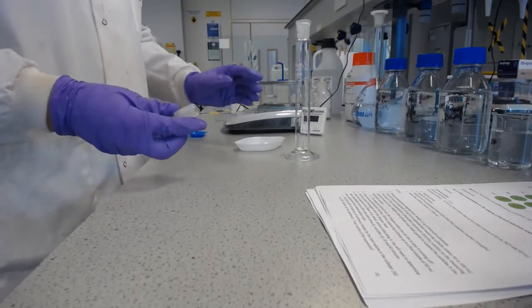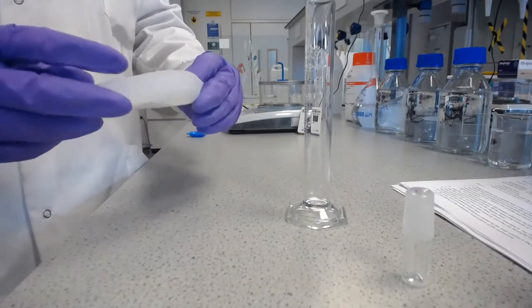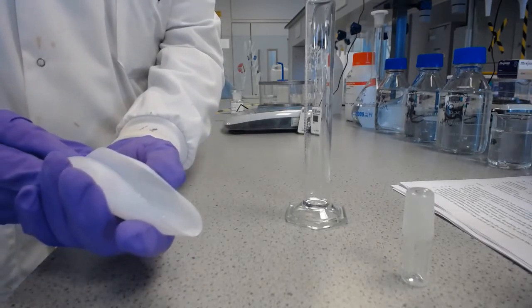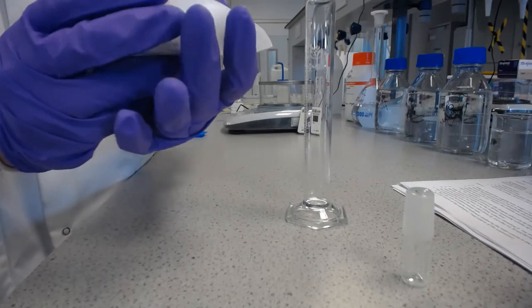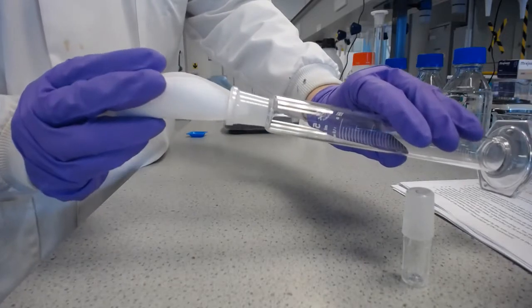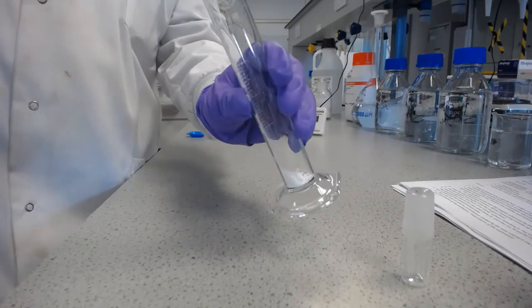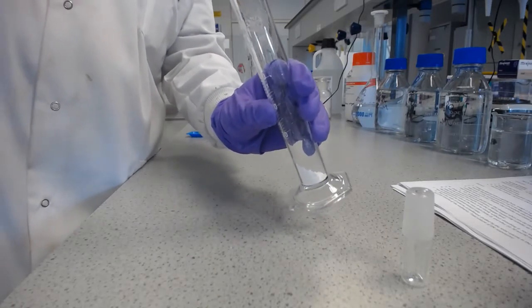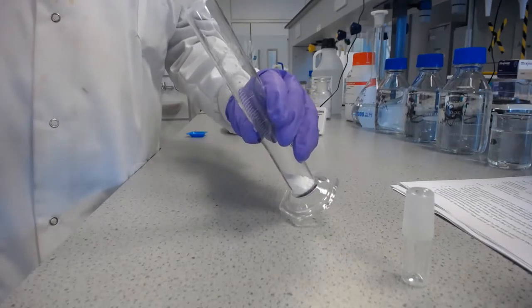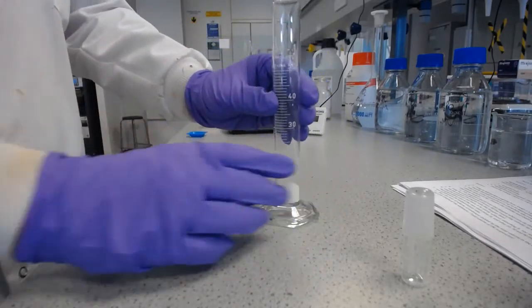And now this needs to go directly into the measuring cylinder. Now what you can do to help with this, particularly useful to use weighing boats, is that you can bend a weighing boat into a small sort of funnel, which will help us to get this in without spilling any. So I'll keep it flat until I'm happy it will go in, and then I can safely pour that in. There you are, without having spilt any. There we go. Wonderful. So that's in there now.